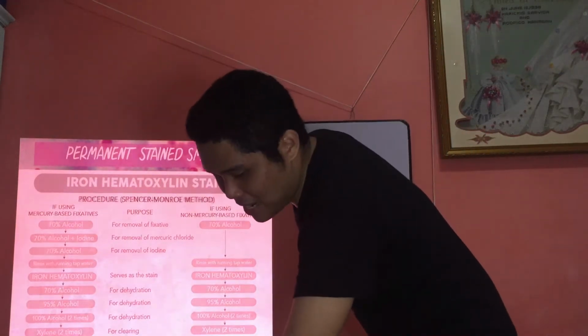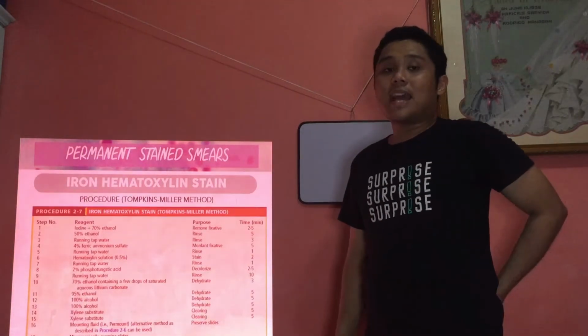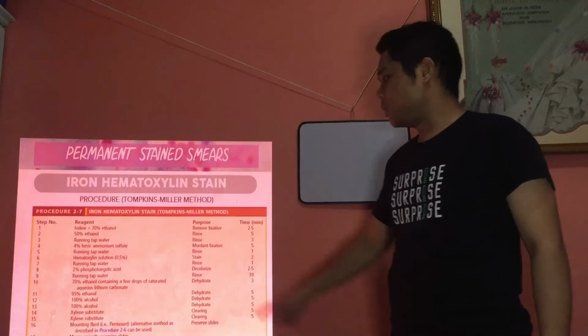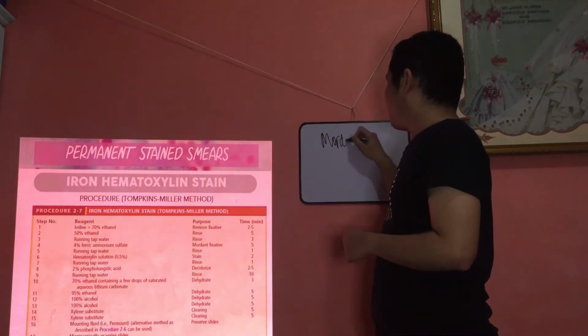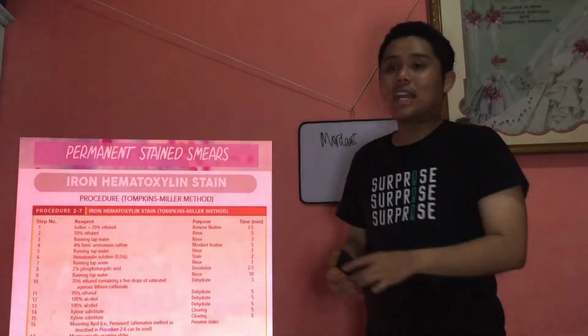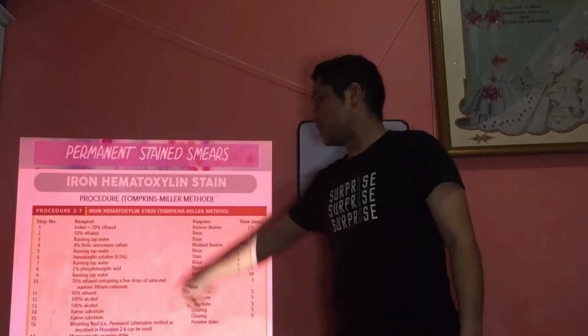Now for Tompkins Miller, there's a modification. So this is again based on your book. You have an additional 4% ferric ammonium sulfate which serves as your mordant fixative. Now what do you mean by mordant? Okay. Later, I'll discuss that in acid fast. Okay. Mordant. Later na yan. So 4% ferric ammonium sulfate.